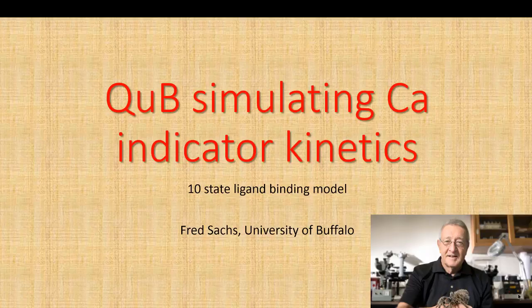This is Fred Sachs from the University of Buffalo. I'm going to show you here how to use QUB to do simulations of any state model you wish.